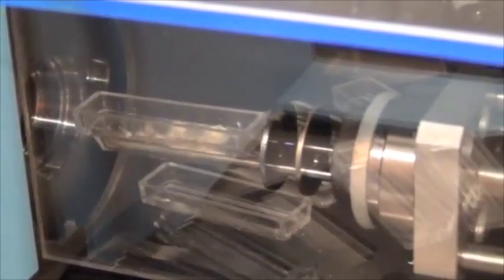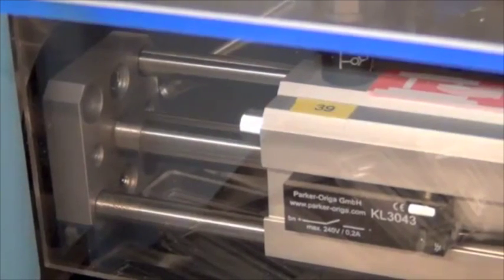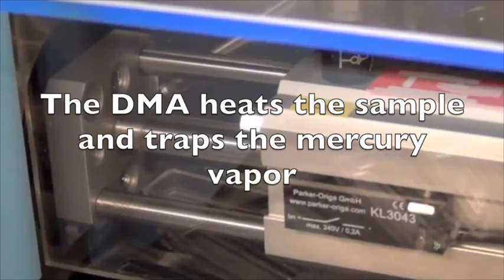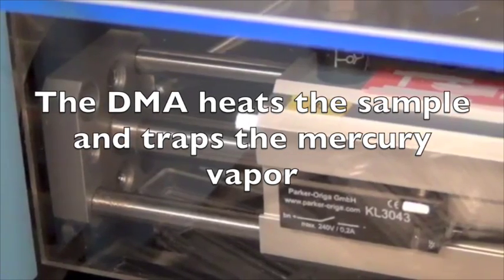It takes about eight minutes for each sample to be run. During each run, the sample is burned completely, and mercury is trapped on a gold amalgamator, and then heated into a vapor to be detected on an atomic absorption spectrometer.